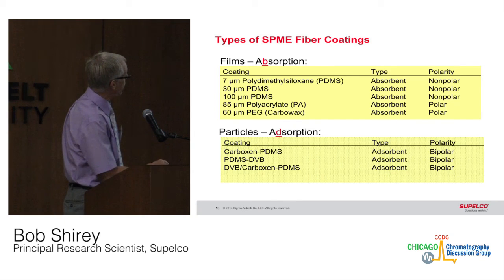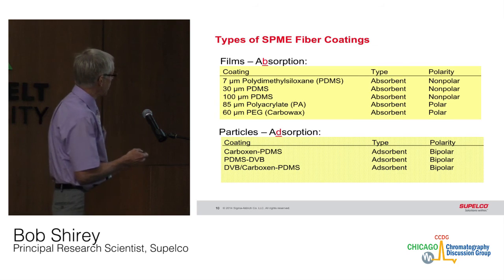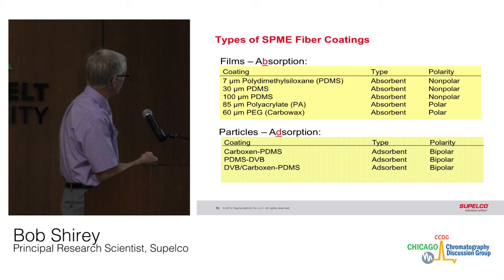Fibers can also be classified by polarity and also by the thickness and type of coating. You need multiple thicknesses with absorption fibers, since thickness is more critical in the retention of the components.